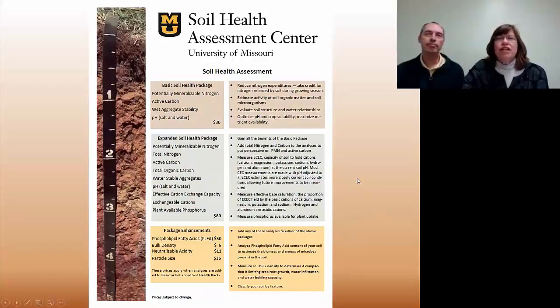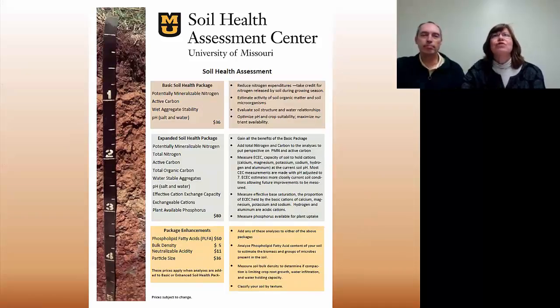This is the Soil Health Assessment Center, and we are now in the College of Agriculture, Food, and Natural Resources at the University of Missouri. And this is just a listing of some of the analyses that we do here at the Assessment Center and some of the packages that we have.